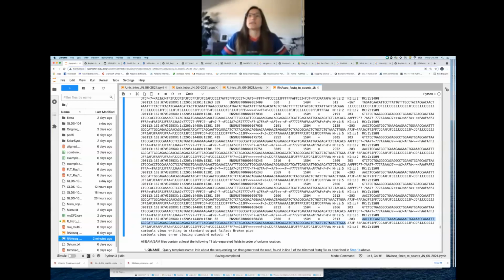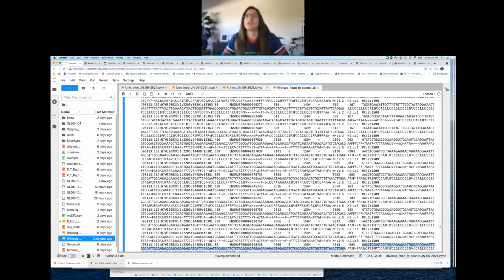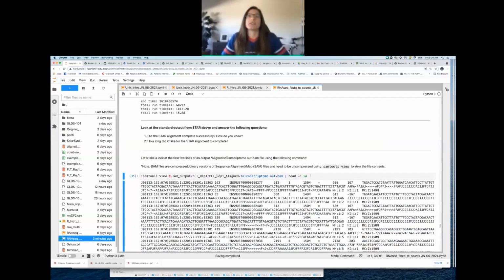And so this is 5. Do you guys want to do 2 more lines to see if indeed the next transcript shown is one that a different set of reads aligned to? Yeah, let's do it. So if we want to see another 2 lines, what would we add to this number? Yeah, so this number would be 16, and we'll take a look at 2 additional lines. So go ahead and add 16 and run it.